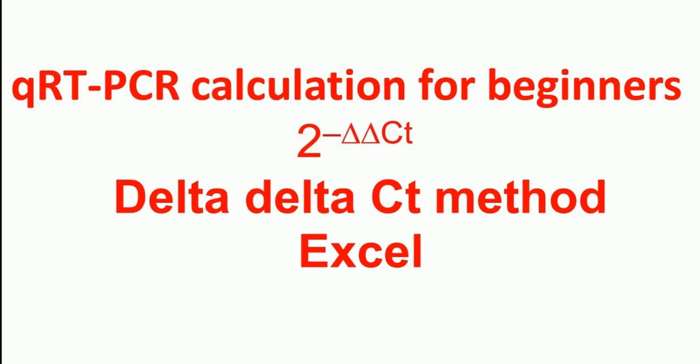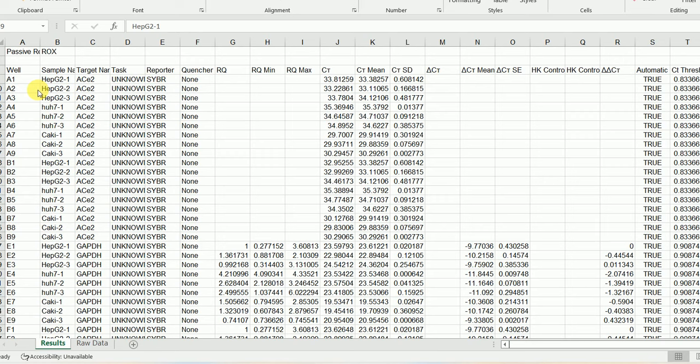Whenever you click on your Excel file from a qRT-PCR experiment, something like this will show up. What you need from this Excel sheet is the Ct value for your controls as well as the treatment samples. For that you need to click on Results. The most important things for you are the sample name, the name of the target, and the corresponding Ct values.